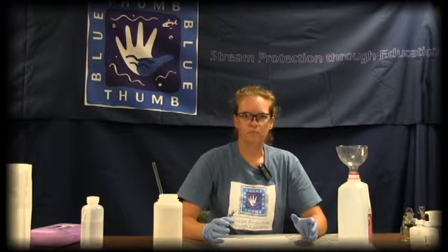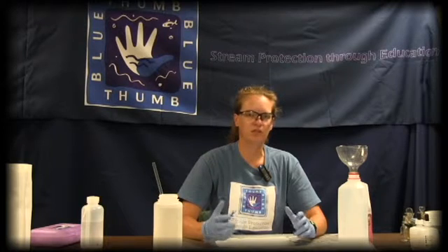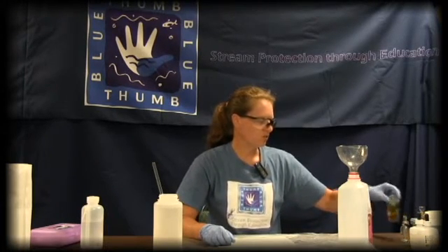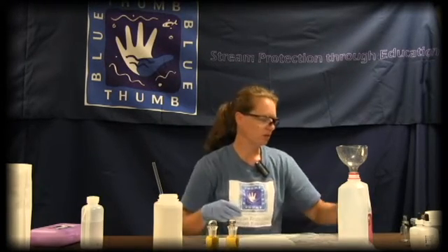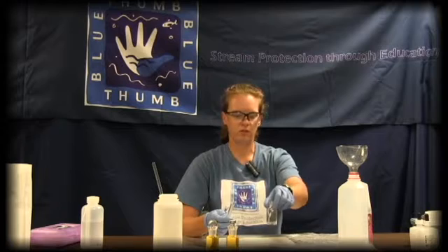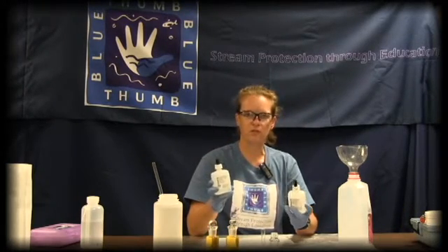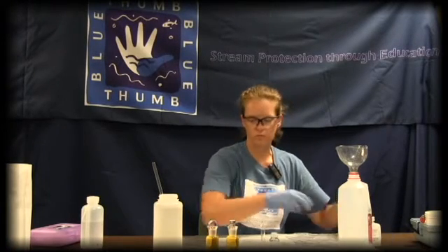Once you've come back from monitoring out at the creek, fixed your dissolved oxygen bottles, filled out the front of the data sheet, and you're coming back indoors with your area ready to start testing, we usually start with a dissolved oxygen test first. From your dissolved oxygen test kit, you'll have your two fixed dissolved oxygen bottles, a square mixing bottle with no markings, a plastic measuring tube, and your two reagents: sodium thiosulfate and starch indicator solution — both liquids.